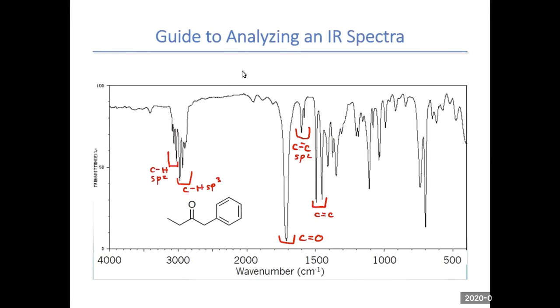One thing to notice in this spectrum is that we have aromatic overtones. You can see we have all those bumps right here between 1800 and about 2000. Remember, when you see these peaks, you know it has to be an aromatic sp2 hybridized carbon versus an alkene. But as you can see also in the fingerprint region, we do not have any carbon-oxygen single bonds, and most of those peaks there are your carbon-carbon single bonds. Those we do not need to worry about.